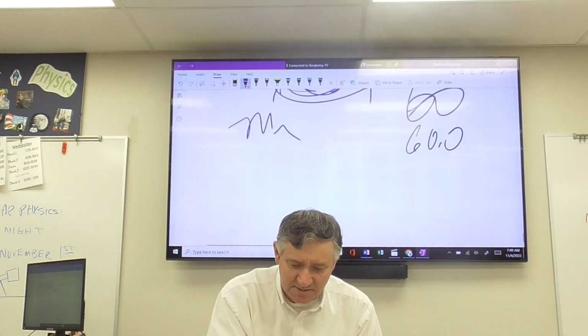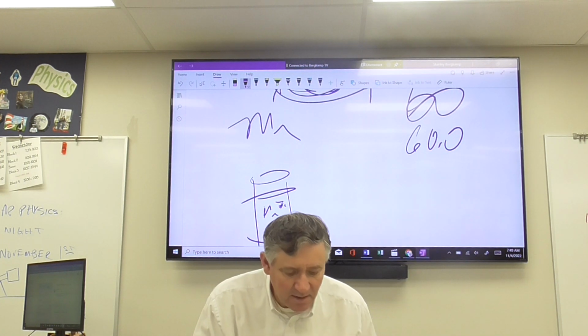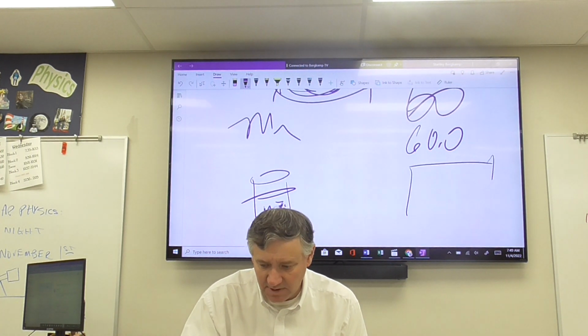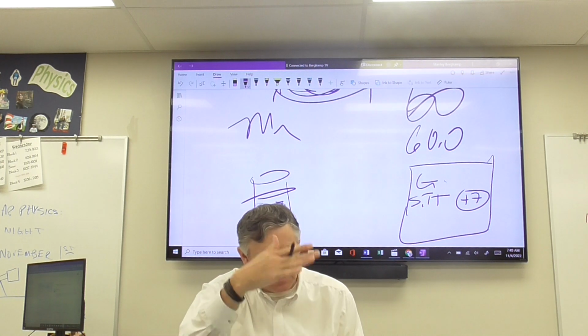So you're going to have a short test tube, and you're going to label that Mn 7+. Okay, that's all you have to do. That's Mn 7+. You don't have to do anything with that. So this is going to be an example. You're going to make a list of your glassware, and the glassware is going to say, a short test tube, and that's going to be labeled +7. That way you know, okay, this is what I have to have.